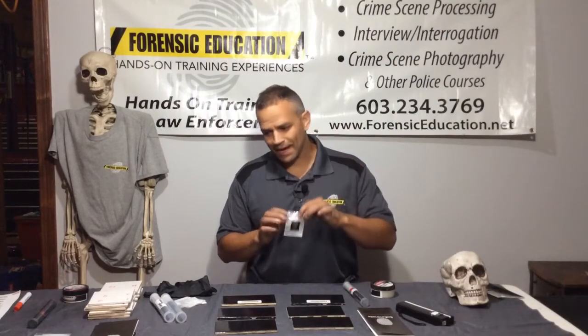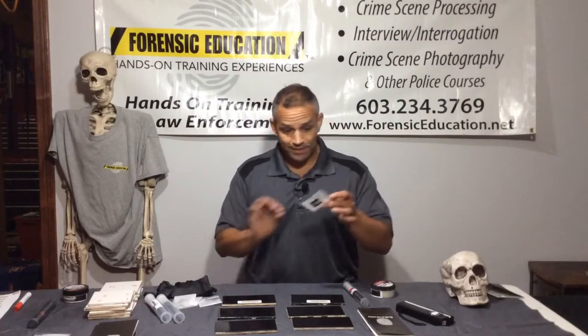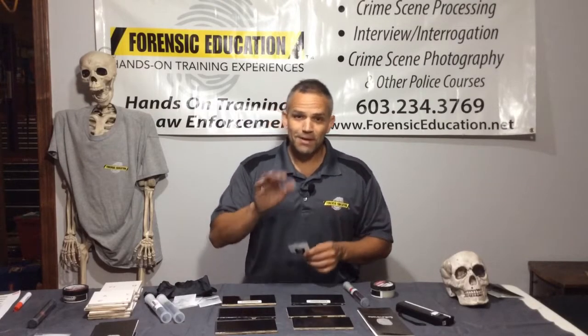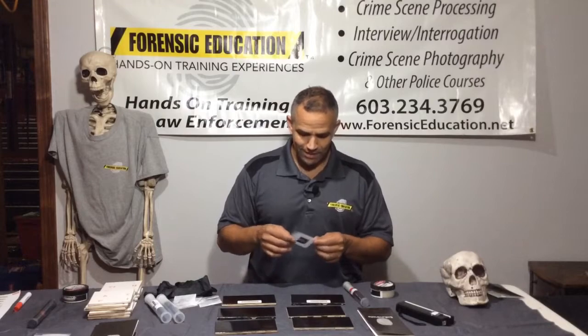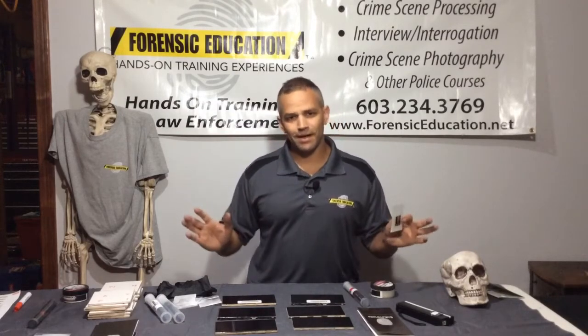The samples come in these little bags. Getting through the airport with little baggies of white powder with a logo on them was a little more difficult than I was expecting, but I'm here and I am not under arrest, so things worked out okay.